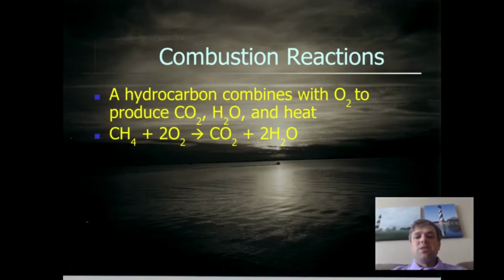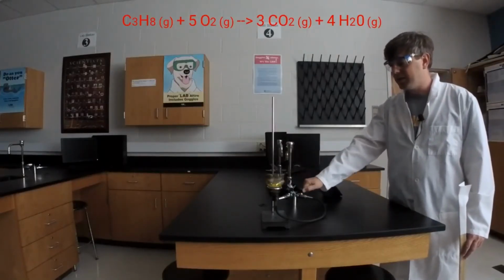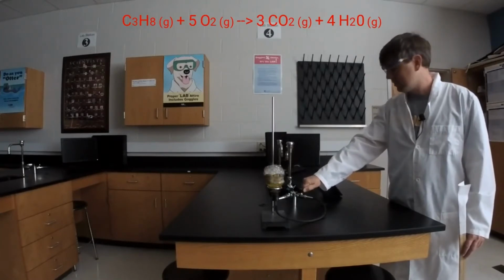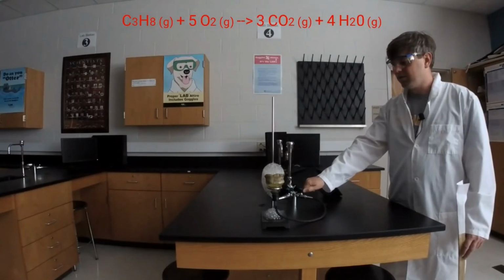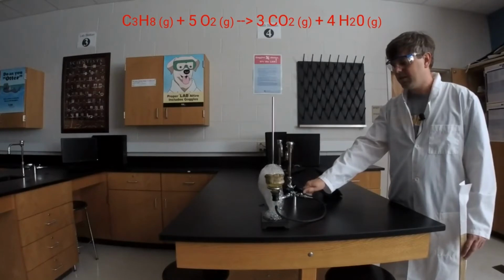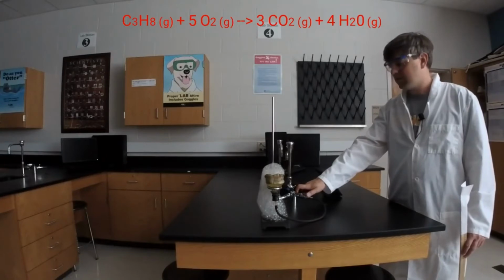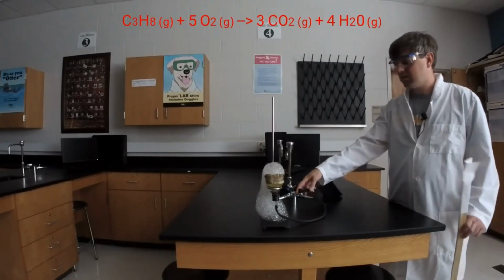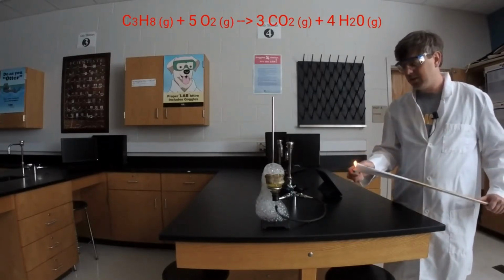I'm going to demonstrate a combustion reaction involving propane now. Got some soapy water, and it's connected to a gas line here. So I'm going to add some propane gas. So we're just blowing a bunch of bubbles full of propane, and we'll see what happens in just a minute here. All right, so I'm going to set this propane on fire.